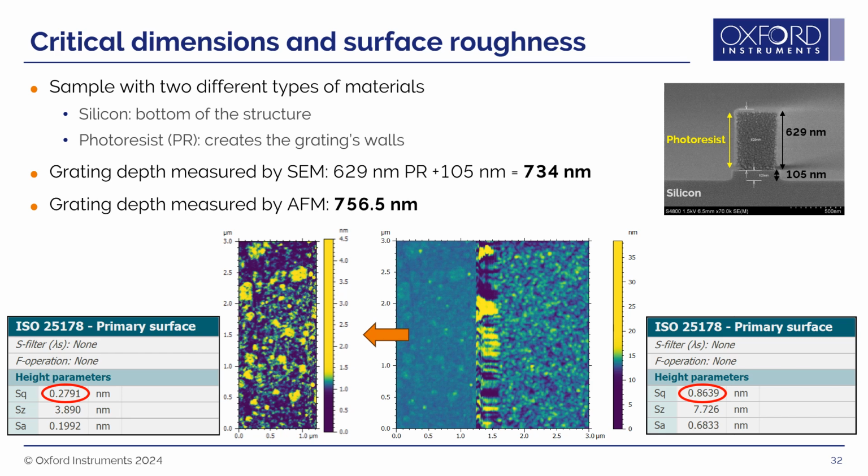In addition to surface roughness, we observe that the silicon portion of the sample is not as pristine as anticipated. After adjusting the color scale, contamination became more visible on the silicon surface. So you can see that the AC55 probe allowed for the characterization of sample dimensions and at the same time was sharp enough to reveal the subtle contamination on the silicon portion of the sample.